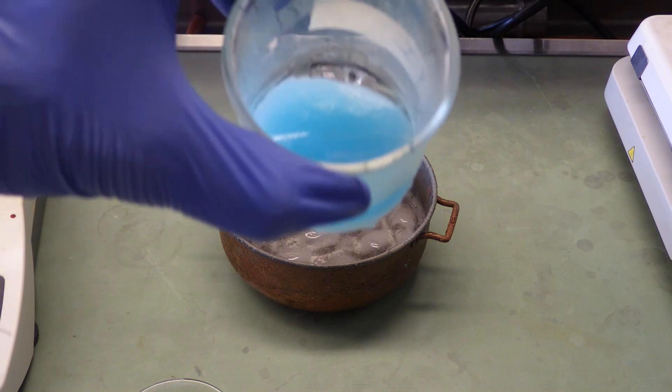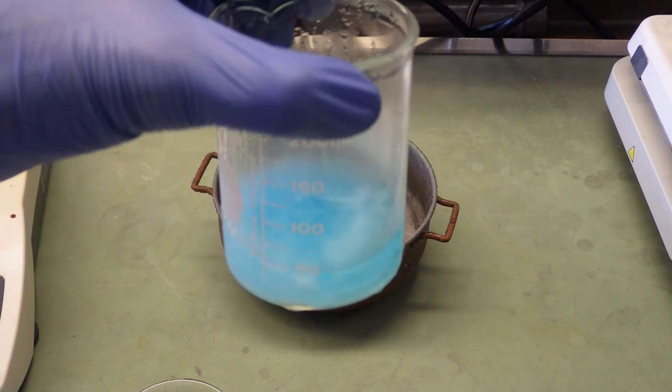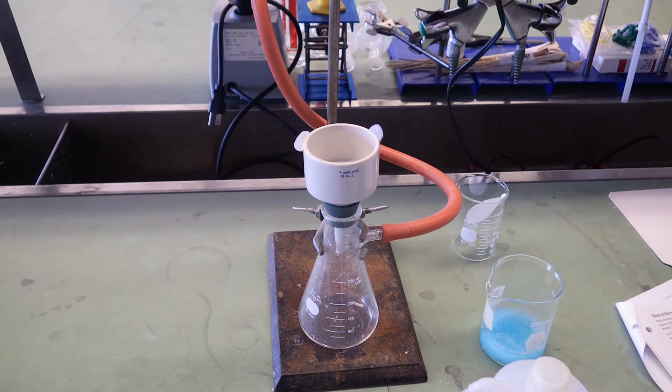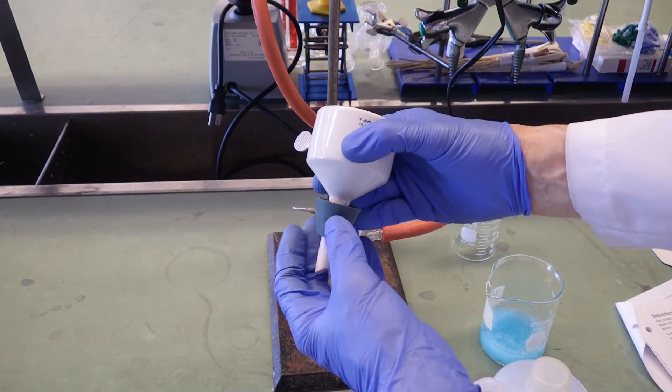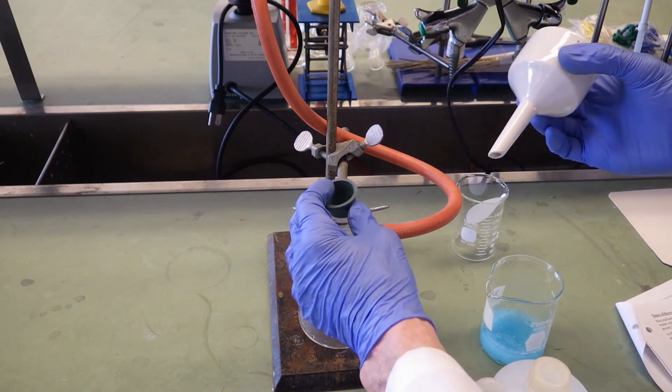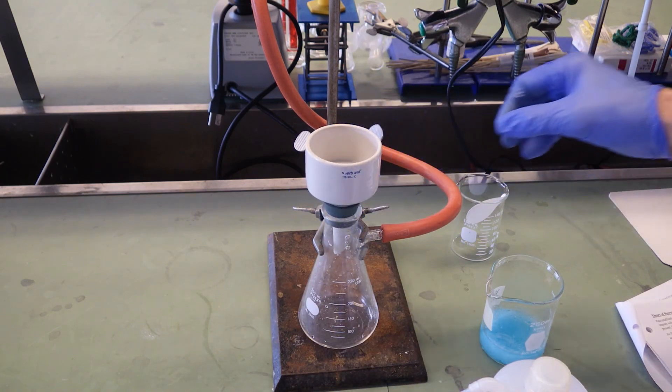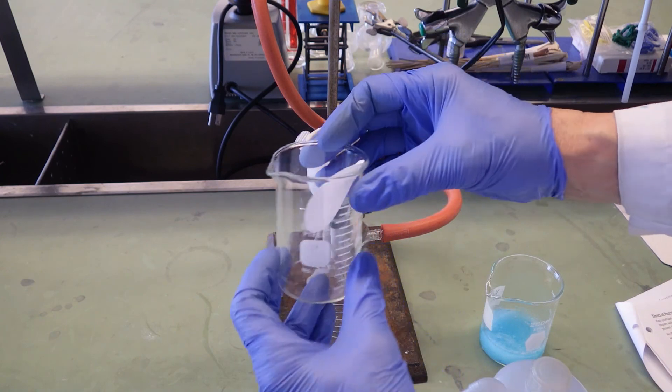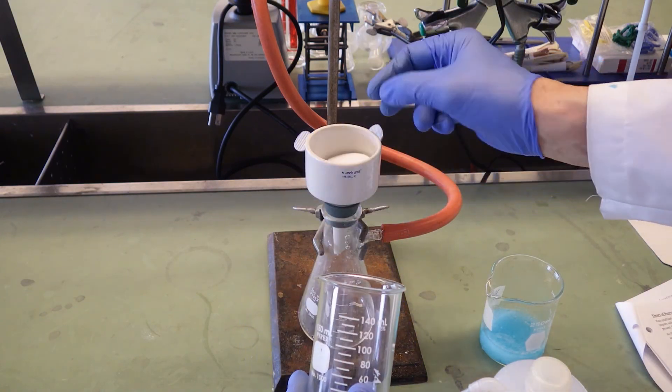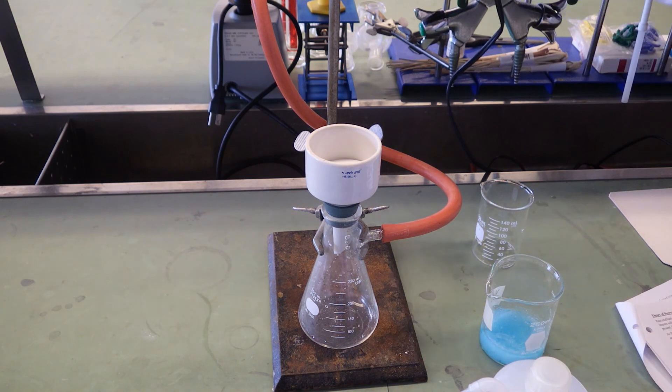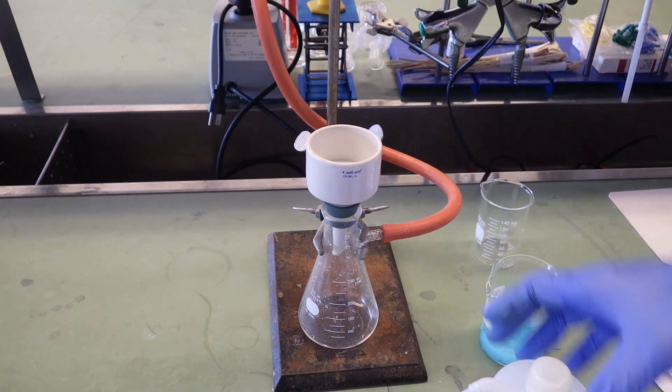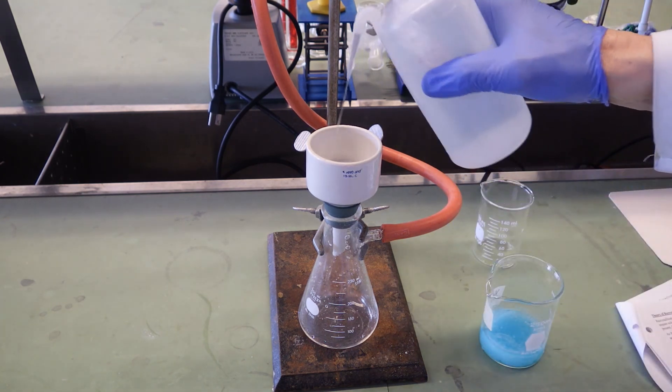We're going to separate this by vacuum filtration. Make sure that you clamp your vacuum Erlenmeyer to a retort stand, otherwise it will fall over. Got a green rubber gasket to make a seal between the Erlenmeyer and the Buchner. We'll take our pre-weighed filter paper, make sure it sits flat—not crinkled or puckered or solids will get under it. We'll seat that paper with a bit of water.